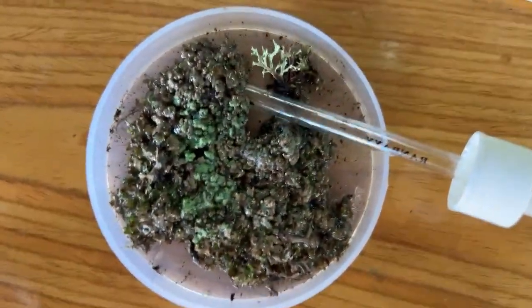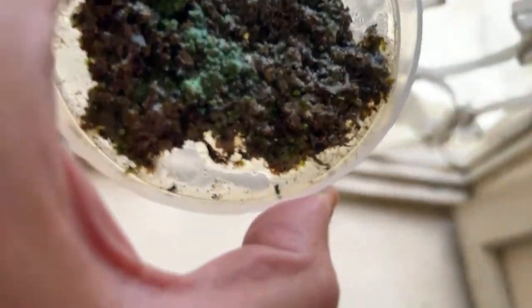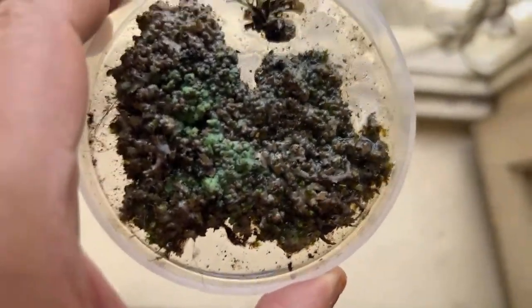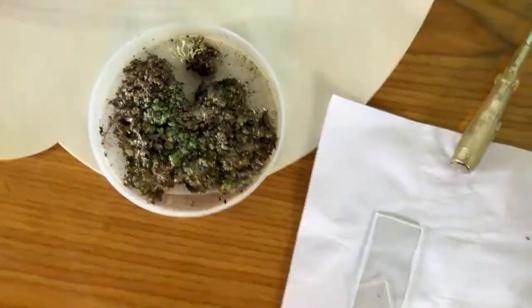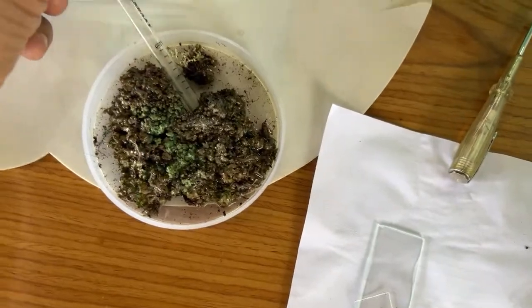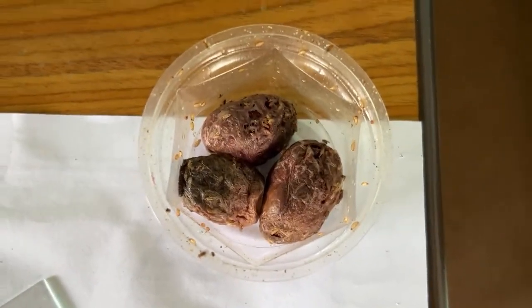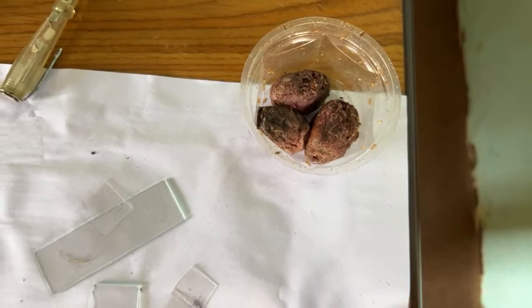A little bit of lichen having some water in a petri dish. This is the water sample that we had been observing, and this is having all those sorts of interplays within the sample. The next sample that I have here is some rotting syzygium fruits, and you already see there are certain life forms growing over it. We'll observe it soon enough.